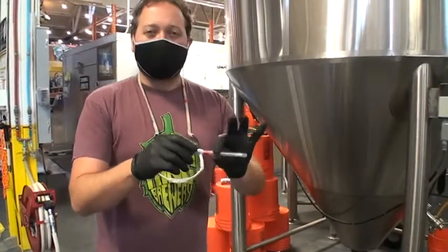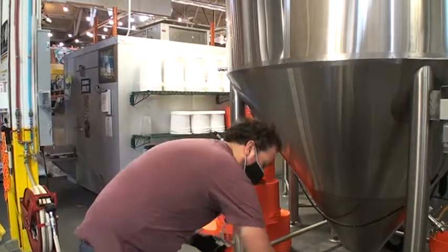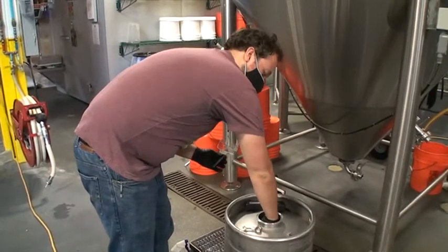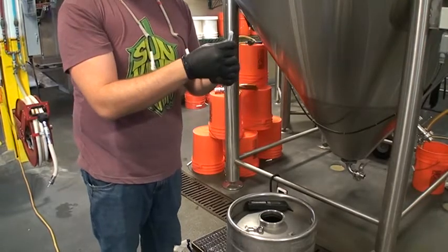We're going to do two tests here. This is our swab, we're going to open it up. I'm going to swab the inside of this brink. I'm going to get all the way around. Would you normally do this, or are you just doing this as a demo? As a demo, but we'll spot check things every now and then.